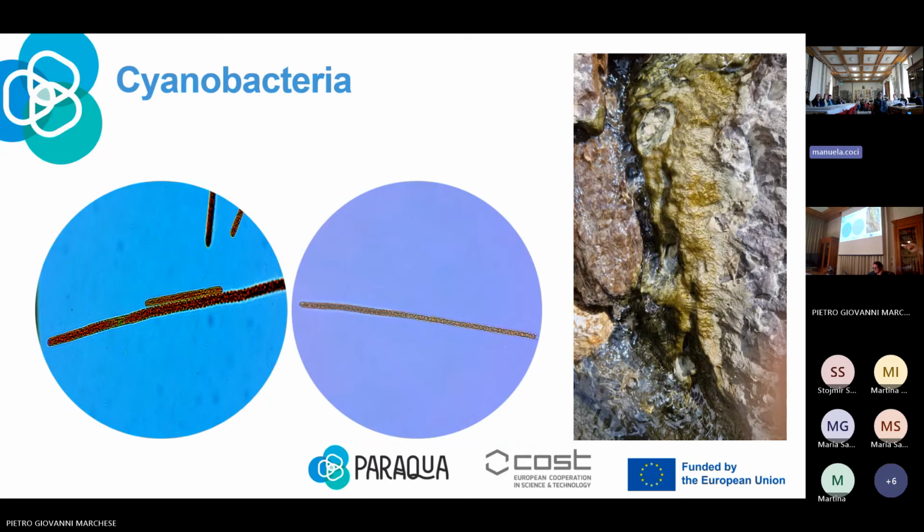Here you have one culture with small dots, maybe they are visible. The culture is contaminated with bacteria, and on the right side, we applied several mixed techniques for isolation to eliminate as much as possible of the microbiota of the cyanobacterium. Here's the Planktothrix agardhii case.